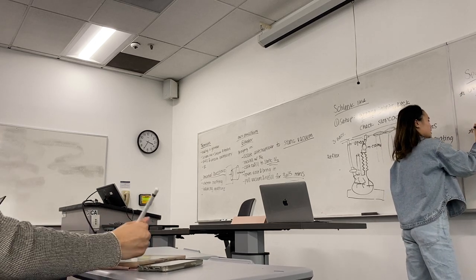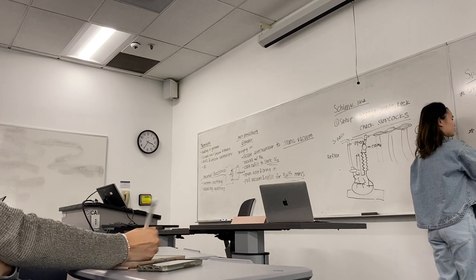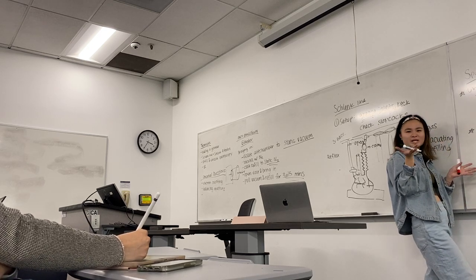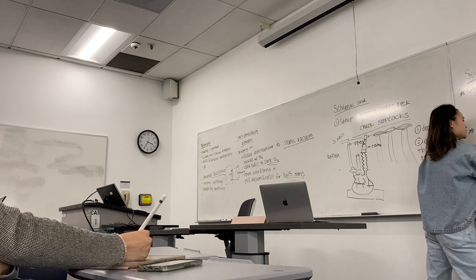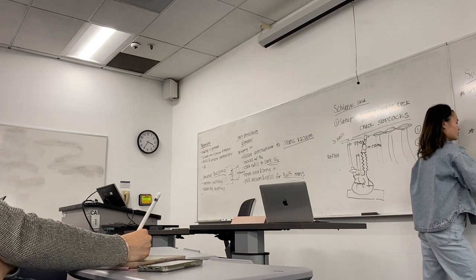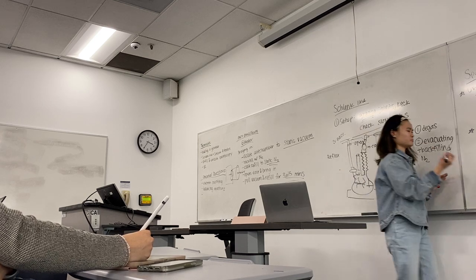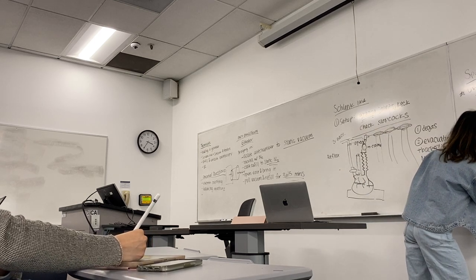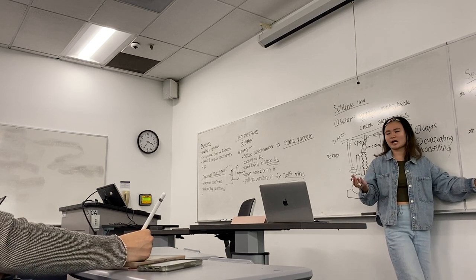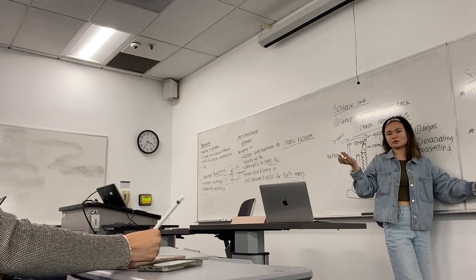And then IR we did for a lot of labs, right? I'm just going to write out what you should know. CH alkanes. What else did we cover? We did CO, NO. Those are the pretty big ones. Oh, broad OH peaks for water. If there's water in your reaction, you'll see a broad OH peak at 3600. That's just if you get water in your sample, but ideally there wouldn't be an OH peak.